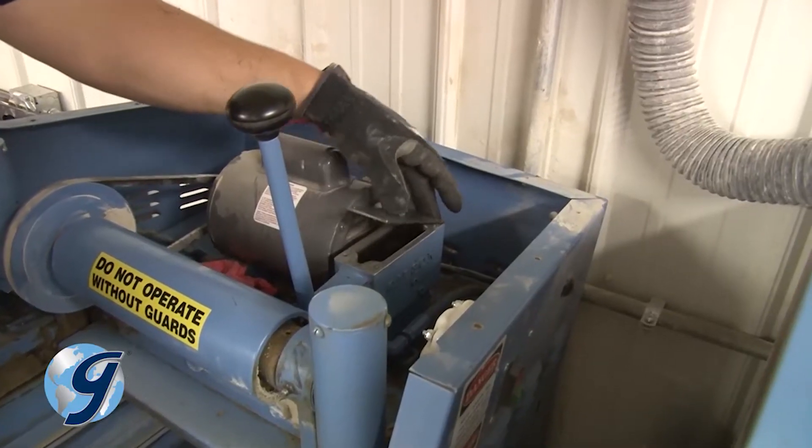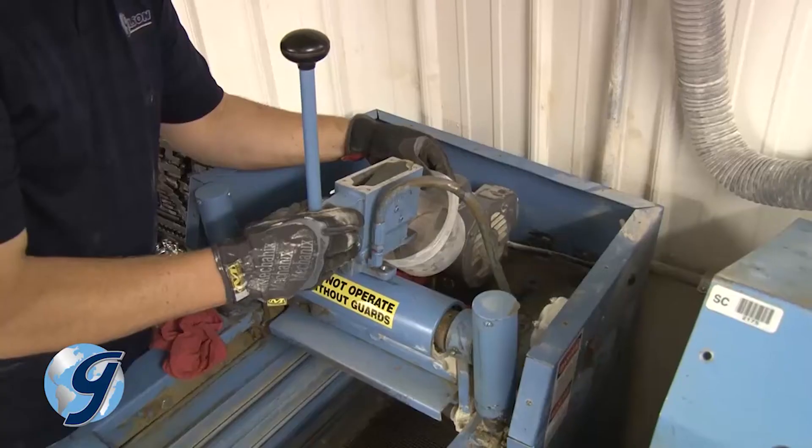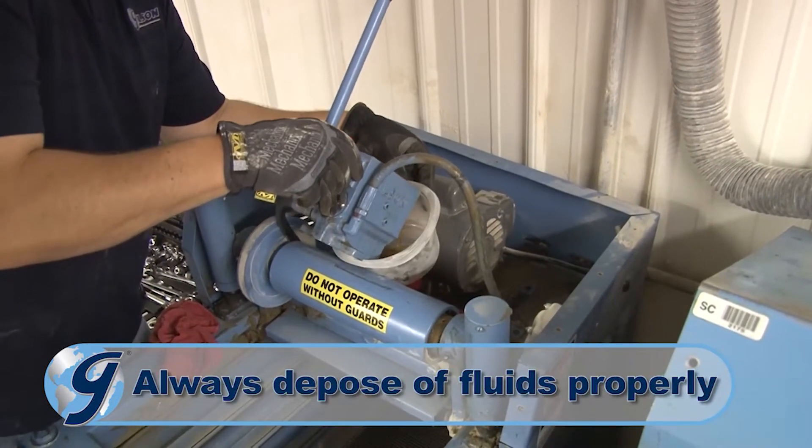Now remove the pump cover and set it aside. Lift the pump out of the unit and drain the hydraulic fluid into a container for proper disposal.